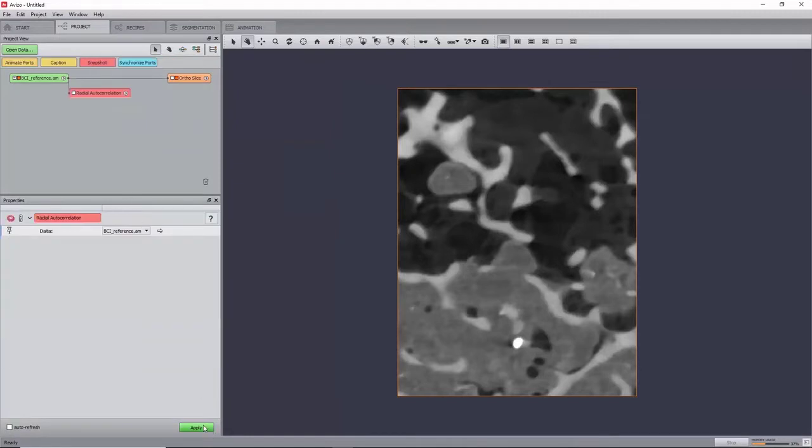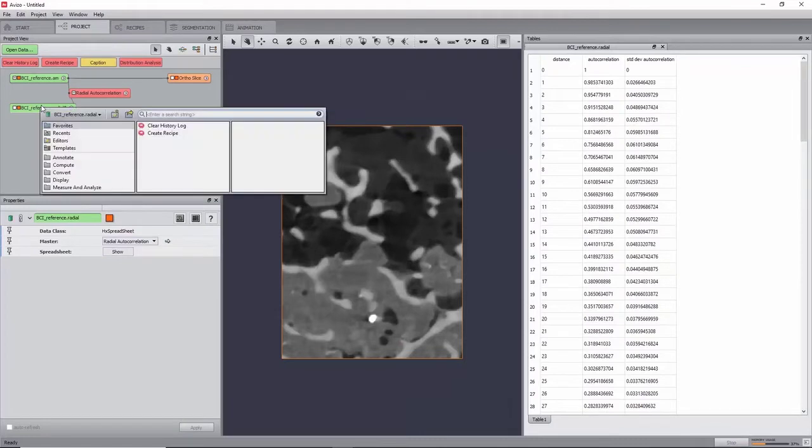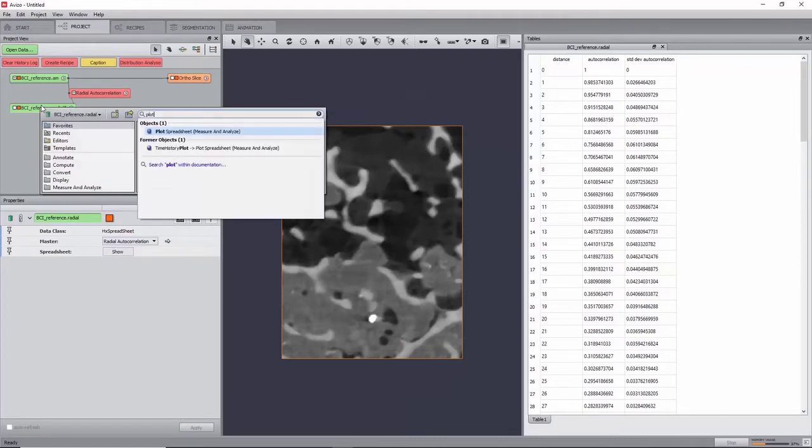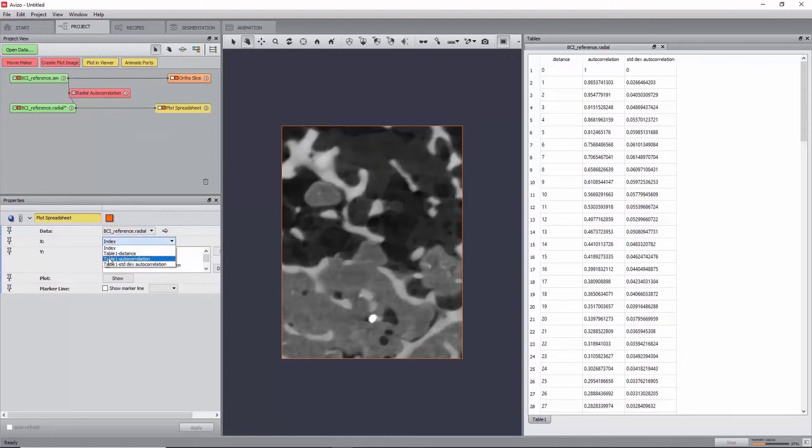This will create a new table with the correlation values as a function of distance. You can plot this by creating a Plot Spreadsheet module, setting Table 1 Distance as X and Table 1 Autocorrelation as Y. Now click Show.